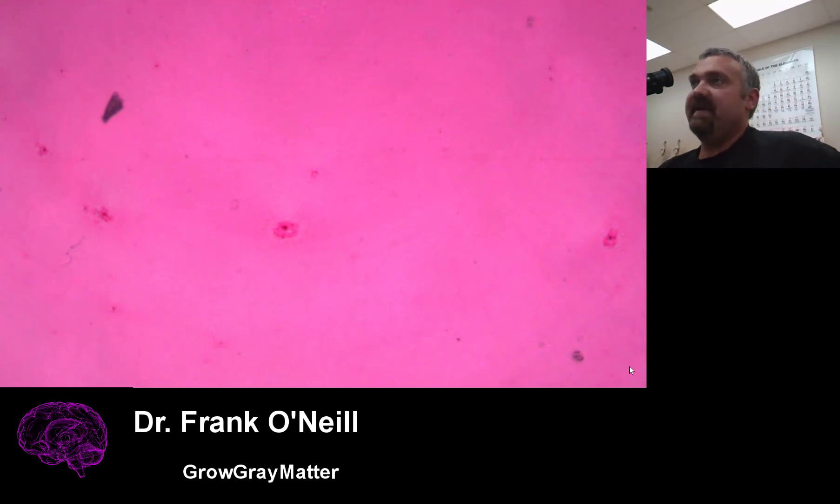A capsule stain is an example of a negative stain, where you can't actually stain the structure you're trying to see. You stain everything else, you stain the background. The capsule is a structure that bacteria can have that greatly increases their virulence, which means it makes them much more dangerous and potentially much more pathogenic.